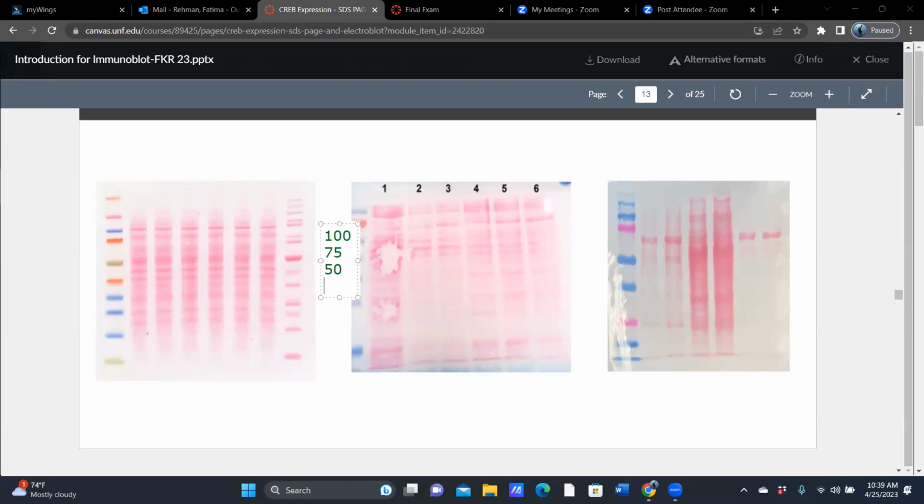And the one underneath is 25, okay? So I know they're not quite lined up, but they're kind of sort of lined up. That one was right here. This one is 25. Okay, let's say that my favorite protein was 75 kilodalton, right? So right here, it's going to fall right in here. Can I use this blot to look for that favorite protein?